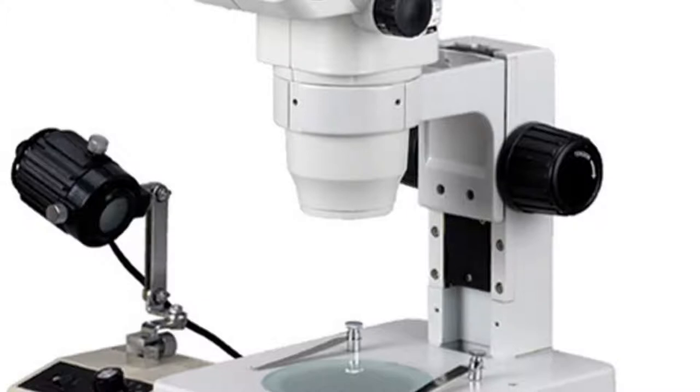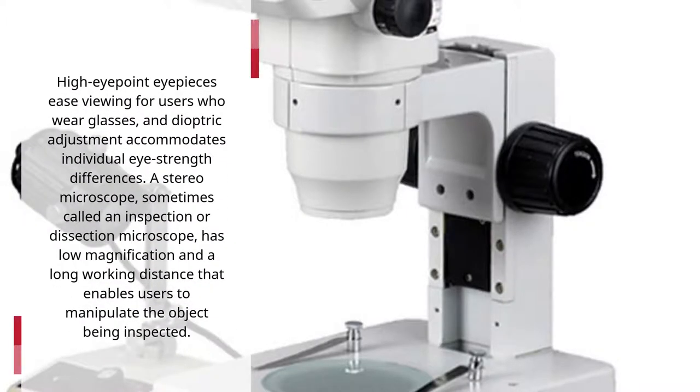High eyepoint eyepieces ease viewing for users who wear glasses, and dioptric adjustment accommodates individual eye strength differences.